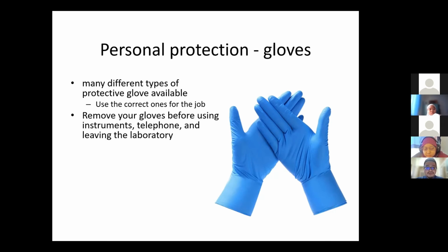And then you need to remove your glove before using instrument, telephone, and before leaving the laboratory. Jangan rasa you ada pakai glove tu, you rasa macam hebat bila keluar daripada lab. Likewise, I don't actually encourage people wearing their lab coats outside the labs. Awak rasa macam, even the medical student pun, if they leave the hospital, they should take off the lab coats, sebenarnya, their white coats.